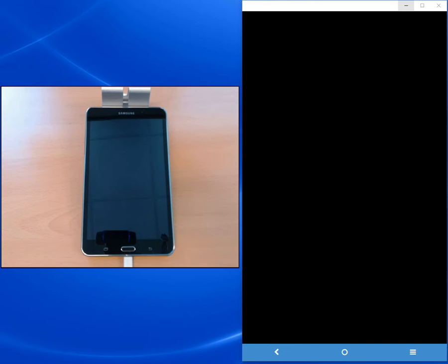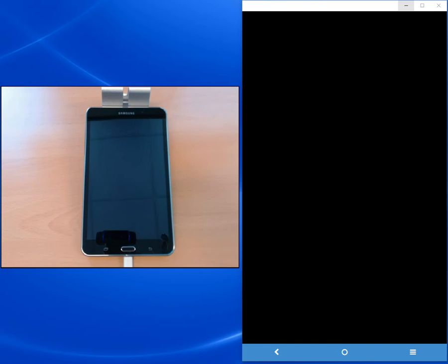Welcome to this PS Touch tutorial video. This time we're going to look at the analytical mode of PS Touch. This mode is already known to our users of PS Trace.